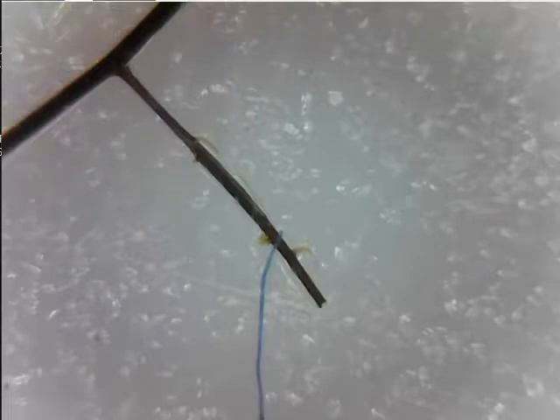Like see, like, look at the ends. It looks like it almost, like, like it was broken and that something snapped. Meanwhile, on the edge, there's this random blue string. Oh, I can't focus on it. Okay, so there's random blue string. Which seems to be above the stick part of the dragonfly wing. And does not look like it's made of various different strands. So I can't prove that it's artificial, but it does look artificial.